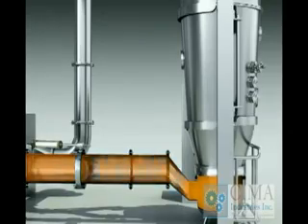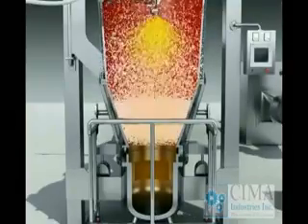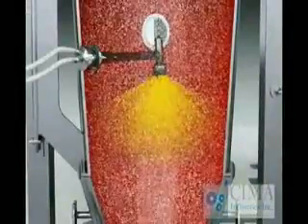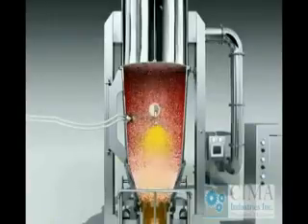The powder should be fluidized when the air velocity is high enough. The fluidized powder is brought up to the expansion chamber and passes through the spray nozzle, contacts the atomized mist sprayed from the spray gun by compressed air. The powder should be accumulated together and forms granules.